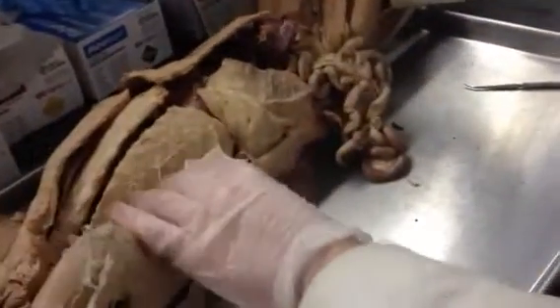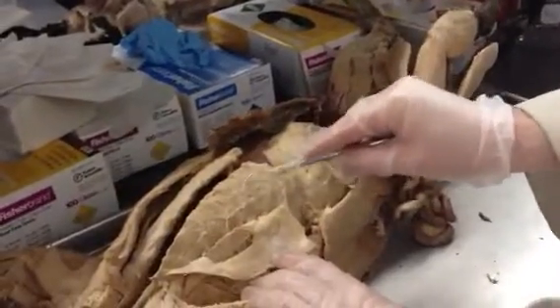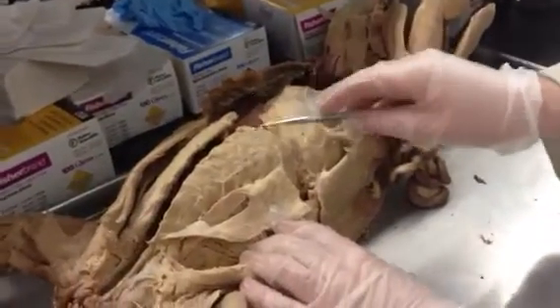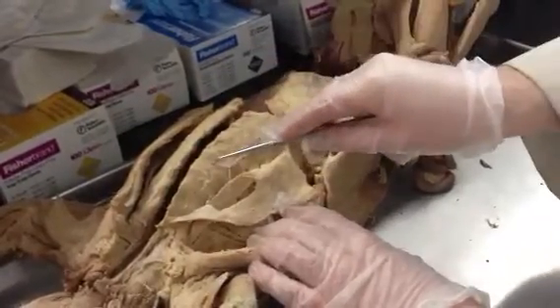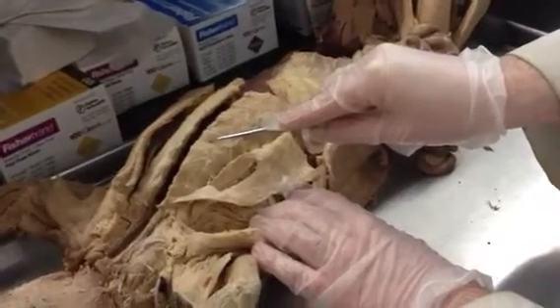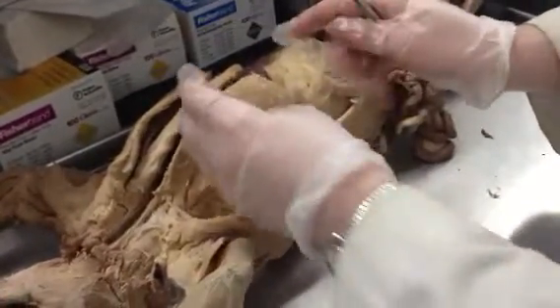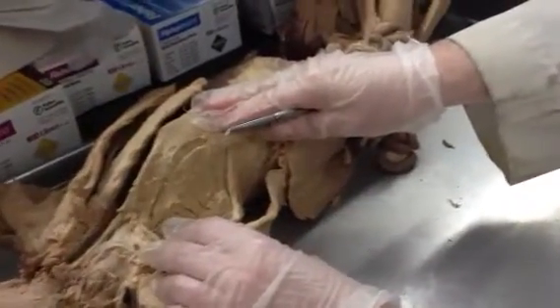Also, the deep muscles here are between the ribs — these are called the intercostals. You only have to know the external intercostals; I will not ask you the internal. So if I put a pin between two ribs, you just write external intercostals. This cat is excellent for the serratus muscles, the scalenes, and the intercostals.